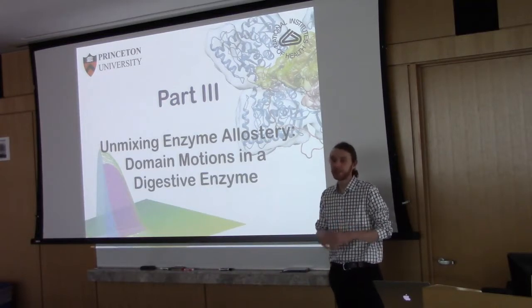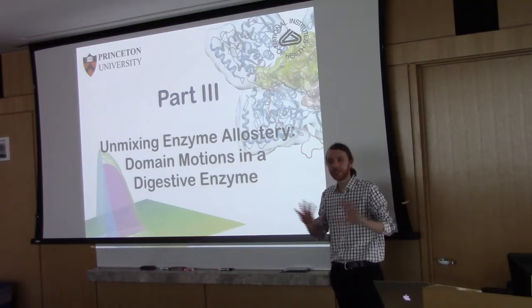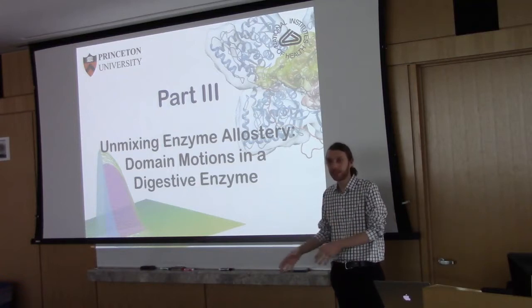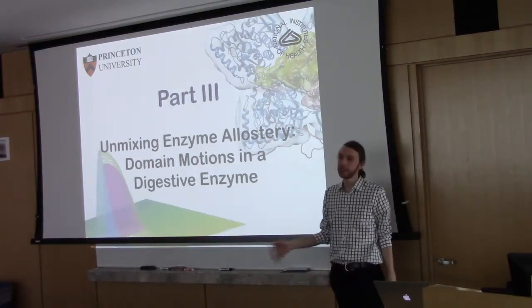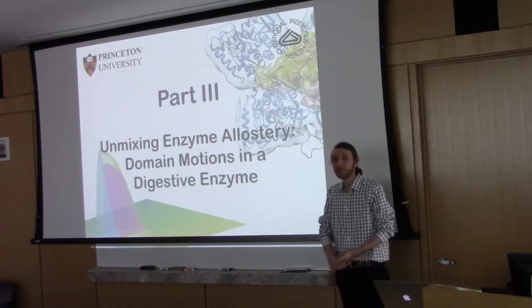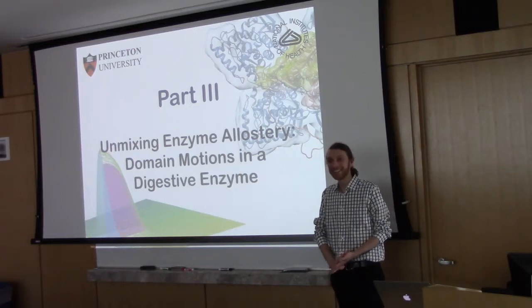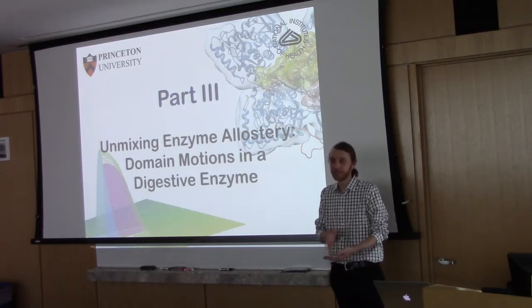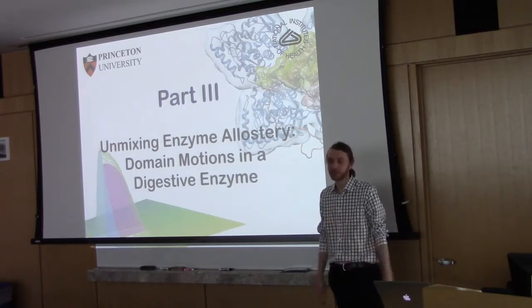But as you mentioned, you could say you don't really care about separating the individual things, and you're just going to rely on reconstructing a mixture. But I think it's always better to try and get clean, unambiguous data if we can. I'm just worried that's what my data is going to be based on this run, and I don't live here, so I'm just curious what I can pull out of it. Yeah, I think often it's very hard to separate things that are closely spaced in molecular weight.